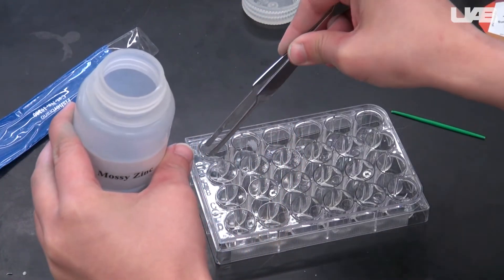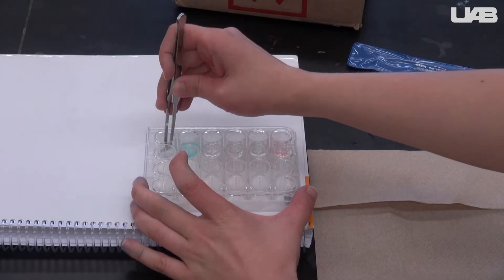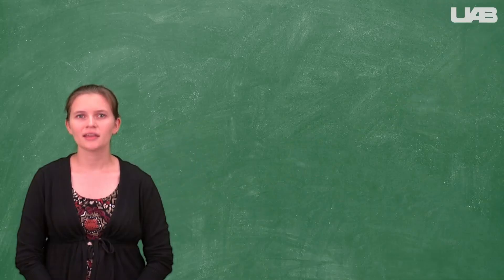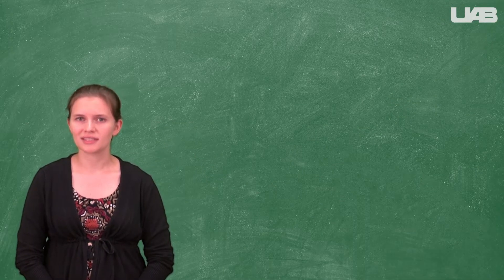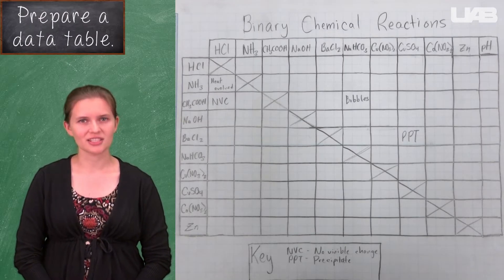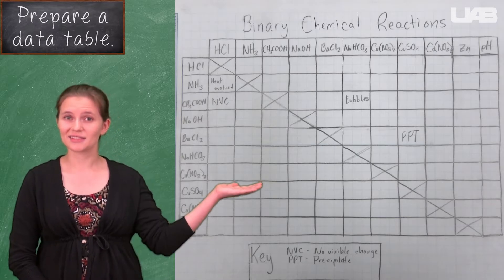Use the tweezers to place the zinc into the well and to remove the zinc from the well plate when you clean up. As you move through the experiments, keep track of your observations using a simple chart like this one.